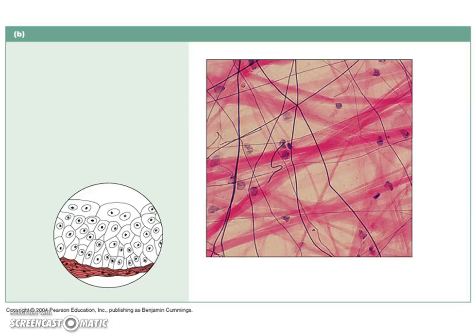Let's look at this first connective tissue. When I look at it, I see a lot of airy spaces in there, so it's areolar. It's called loose because the fibers aren't stacked one on top of each other, but they're all spread out. You find loose areolar connective underneath all epithelia as part of the basement membrane.